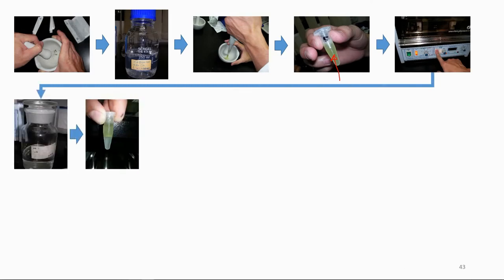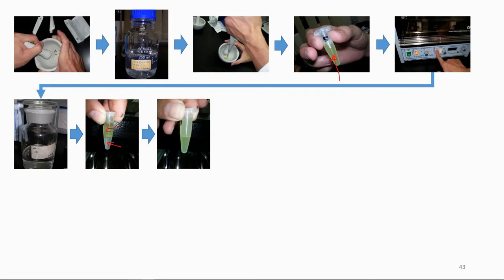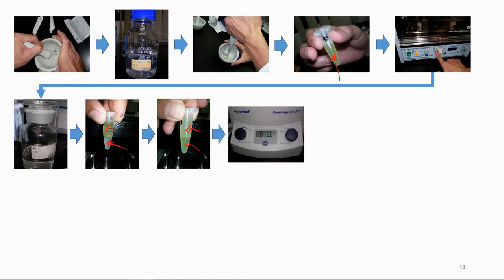After that, add chloroform to the CTAB solution — you can now see two layers. Shake and invert the tube for one minute. You'll notice the chloroform, which was clear, becomes greenish, and the CTAB layer becomes clearer. This means the other compounds — chlorophyll, protein, lipid, and similar things — have been isolated and moved into the chloroform phase. This is the isolation phase, and to make the separation more effective, use a centrifuge.